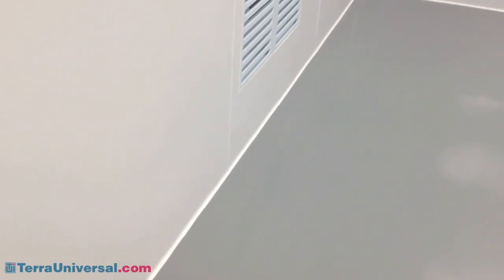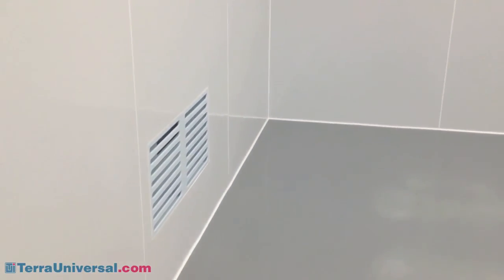For more information on Terra Cleanroom products, visit our website or call to consult with a Terra Cleanroom Specialist.